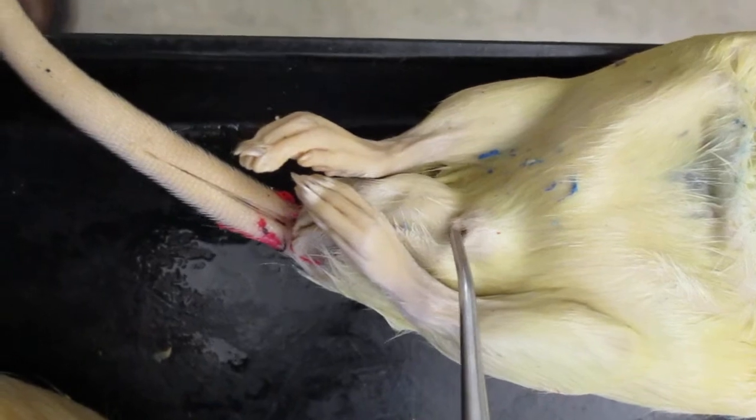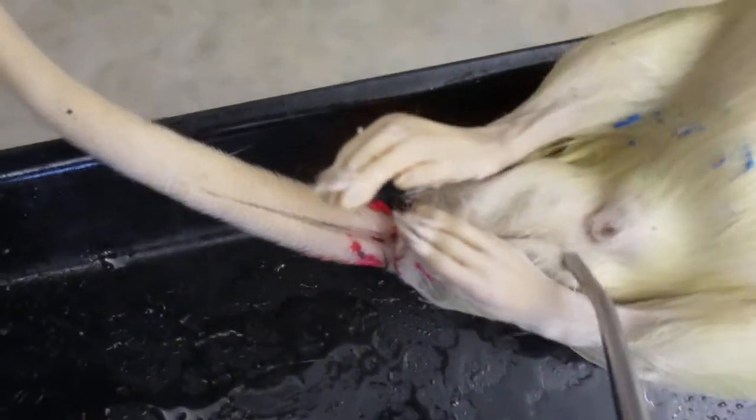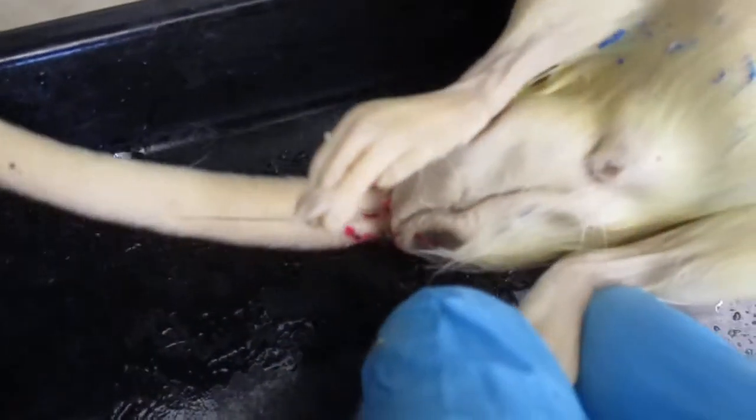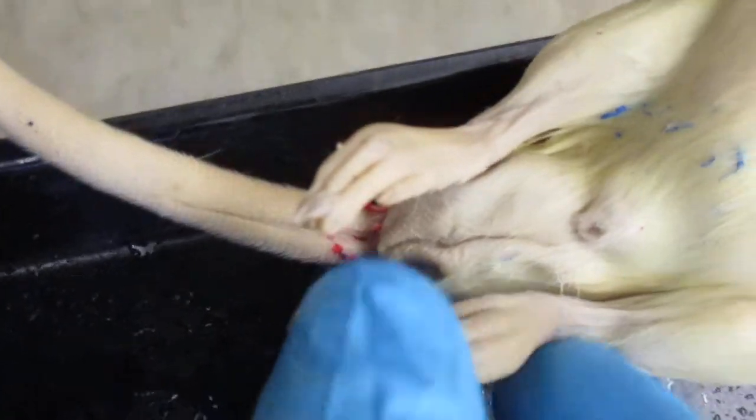You can see the urethra opening here, and you can see the scrotal sac right there and right there. Hopefully you can see that scrotal sac right here. Scrotal sac, left and right.